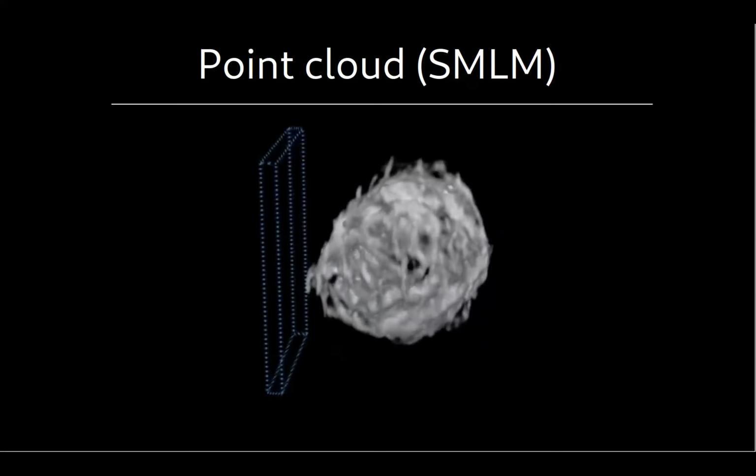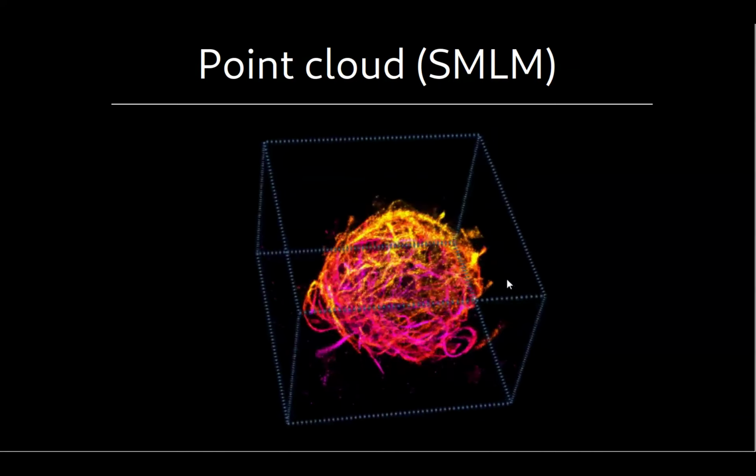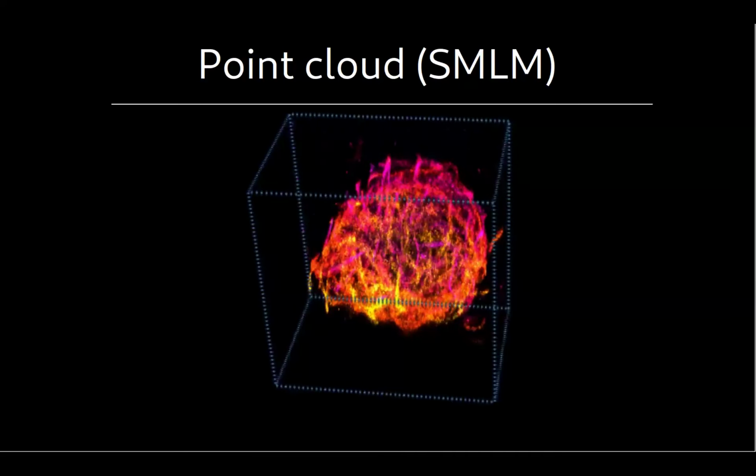So this is volumetric data, the pre-acquisition for the 3D data. This is an immune cell, and these are microtubules of the immune cell, and this is one reconstruction.